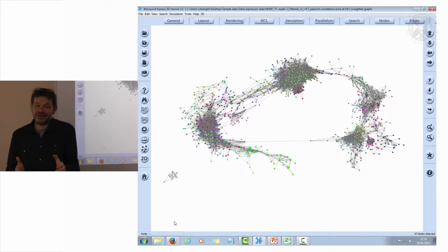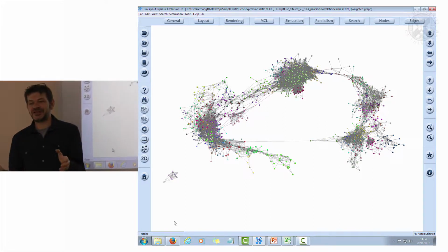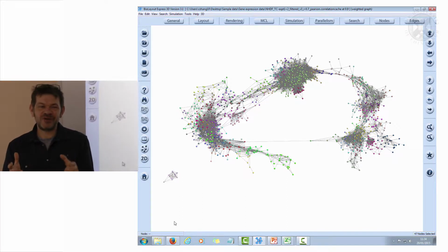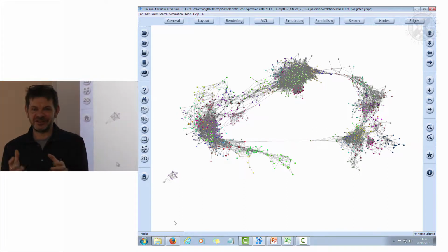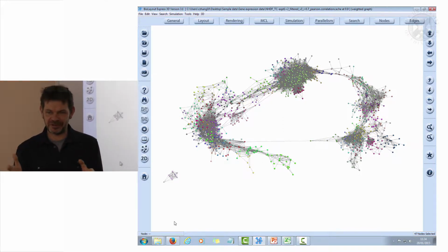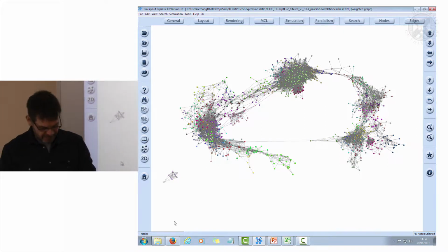I like that, but it does mean that if you ask the question, what's the difference between 0 and 12 hours, you can do that statistically, you can get a list of genes and you feel happy about it. What you don't know is really what background you've selected those genes from and whether there were any technical issues associated with the comparisons that you want to do. So just to say a little bit about how we might do this.